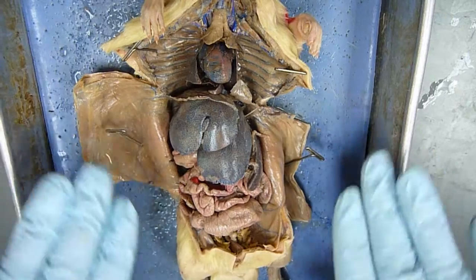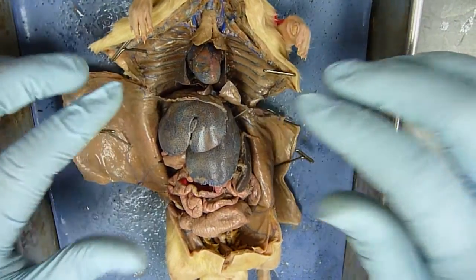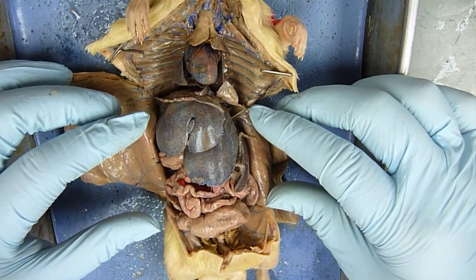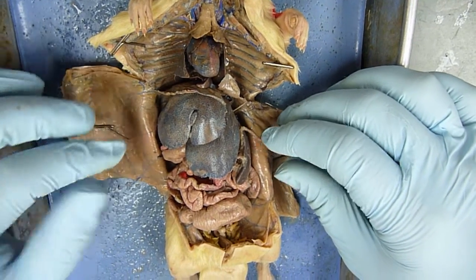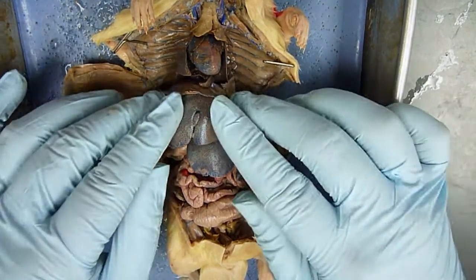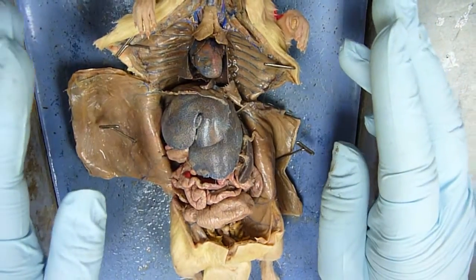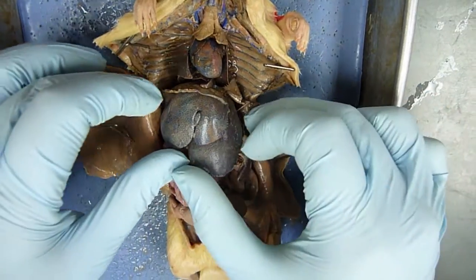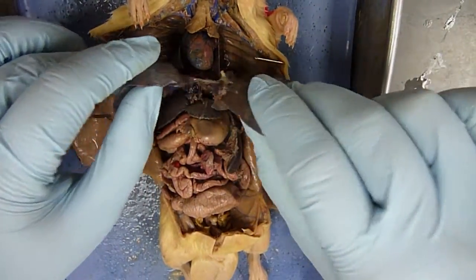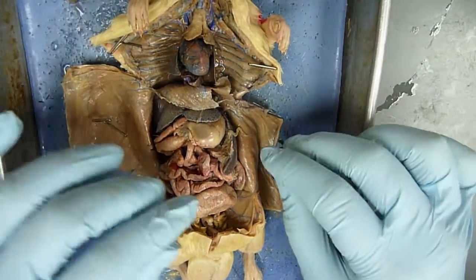Okay, now for the abdominal cavity here, which is the rest of the organs. I want to point out a few obvious major organs first, and then we'll talk about the digestive tract. So of course, these are the biggest organs. These are all the lobes of the liver. So you can take these out so that we can see some of the others here.